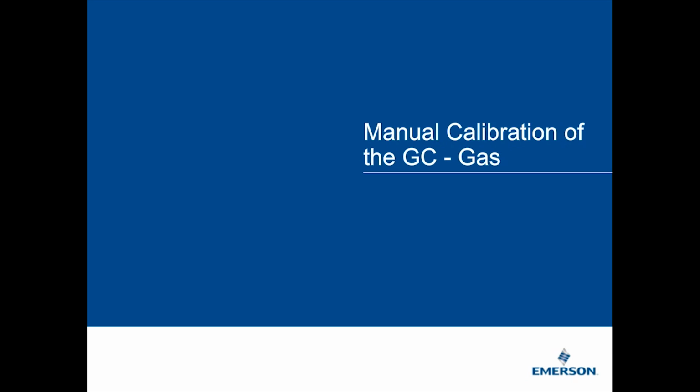How frequently should we validate or calibrate a GC? So in that particular question, for calibration, it's whatever your requirements are. We're not going to tell you what that is. So for pipeline custody transfer applications, most of the tariff specifications say 24 hours.